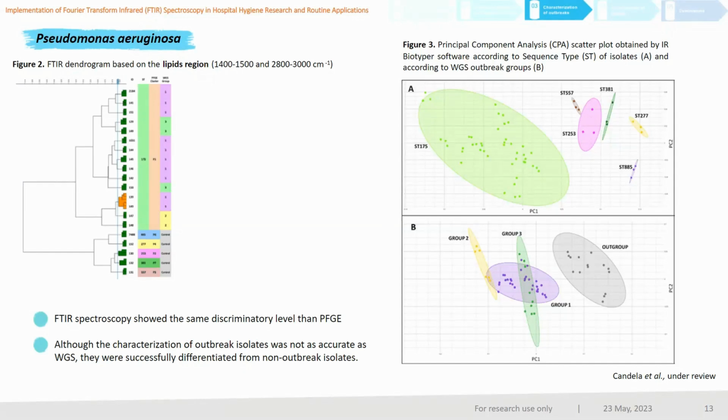It is important to note that during the initial studies of a microorganism, it is advisable to explore various analyses, visualizations, and results obtained with different regions of the spectrum. This allows us to determine the most suitable combination for future studies involving that particular microorganism.